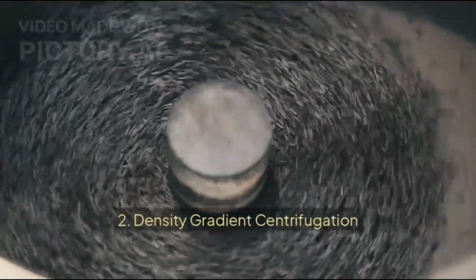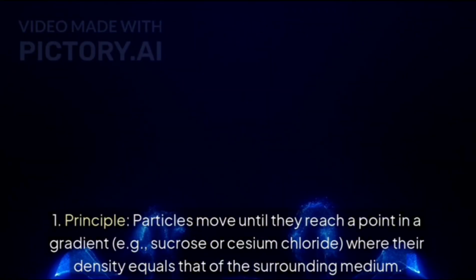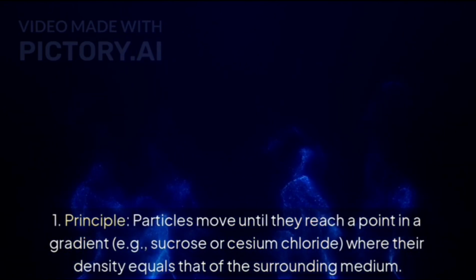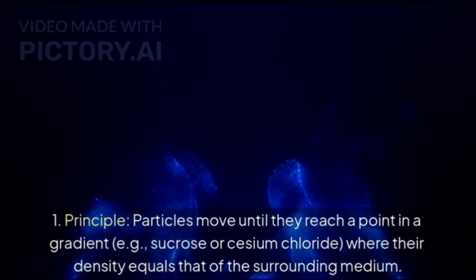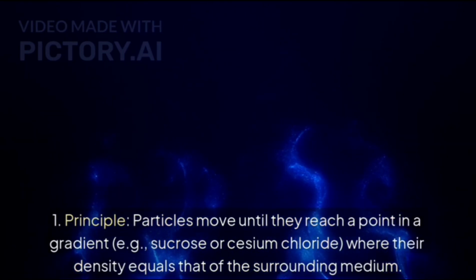Density gradient centrifugation. Principle: particles move until they reach a point in a gradient. Example given: sucrose or cesium chloride, where their density equals that of the surrounding medium.